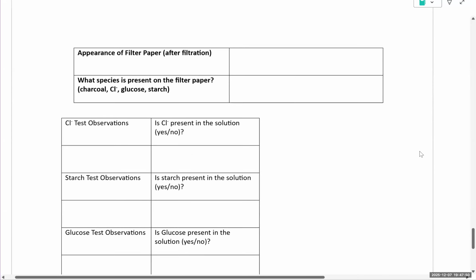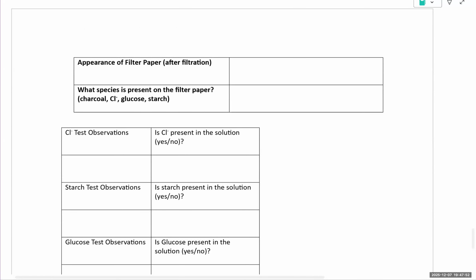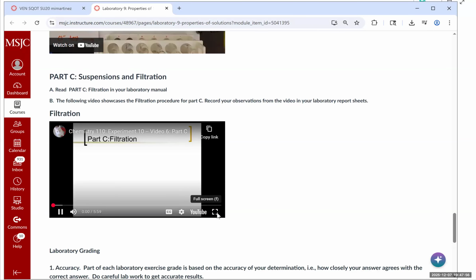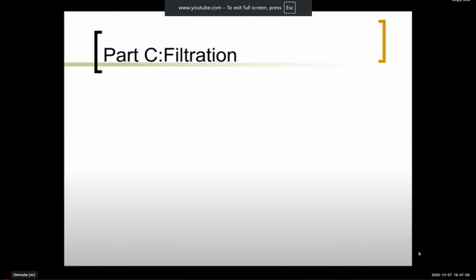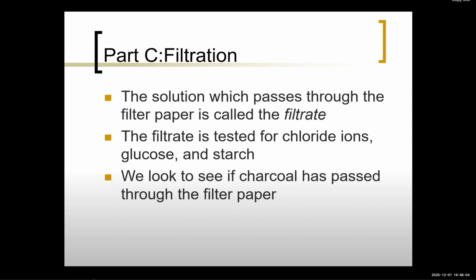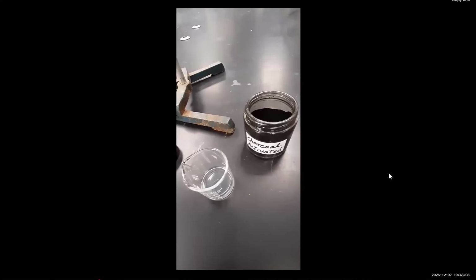Okay, so let's take some observations. So here is the video for suspensions and filtration. I'd encourage you to watch the introduction to this video as it provides a lot of useful information. Let's go on to the actual procedure.